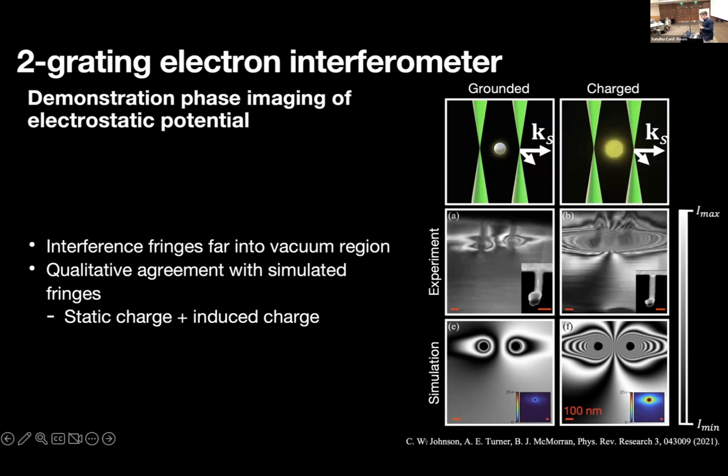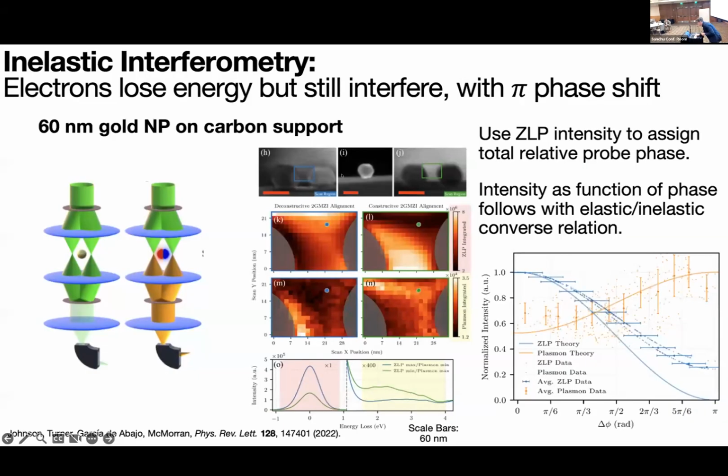This does suggest a kind of far out interpretation. So we're looking at one wire in this case, or here we're imaging, let's say, a single nanoparticle in these images. And then I've often wondered, what if you were the electron? You're the electron in the interferometer, what do you see? Of course, in order to see or to measure something, you have to be more complex than a single electron.